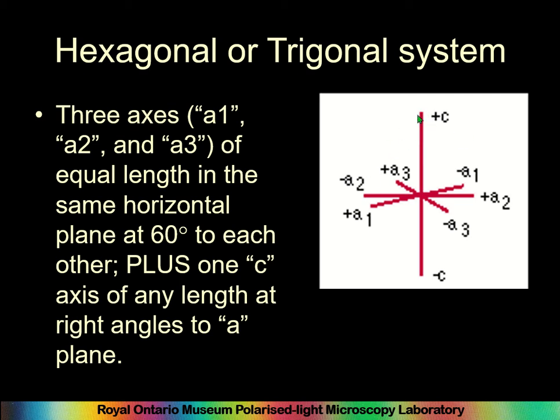So if you have ever gone weird when you were at high school and got quartz crystals, not that that's weird, I don't want to be pejorative, I believe in quartz crystals, go straight ahead. And these are, if you've seen quartz crystals, exactly what you're dealing with. These 6 sides created by this crystal structure and a long crystal going in this direction.